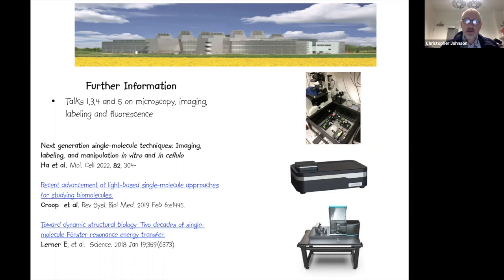Well, they should give the same molecular weight. In the case of SEC-MALS, your polydispersity within your sample is resolved on the size exclusion column, hopefully. And therefore, you determine the mass from individual components eluting from that size exclusion. Whereas in iSCAT, you observe all sizes of particles or masses of particles simultaneously. That is then the reason why it is so quick.